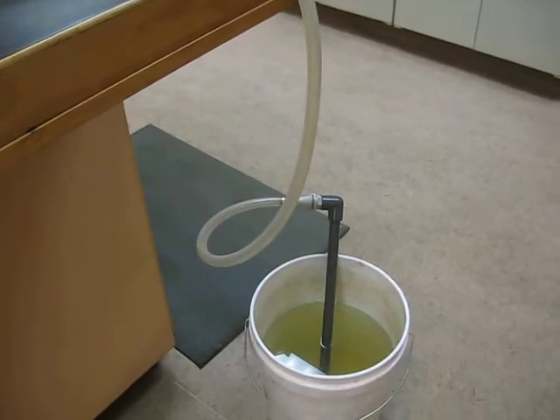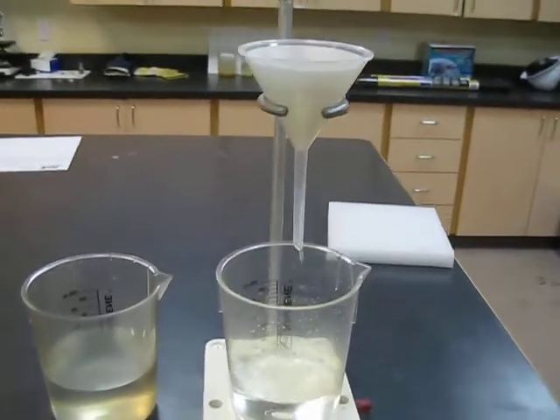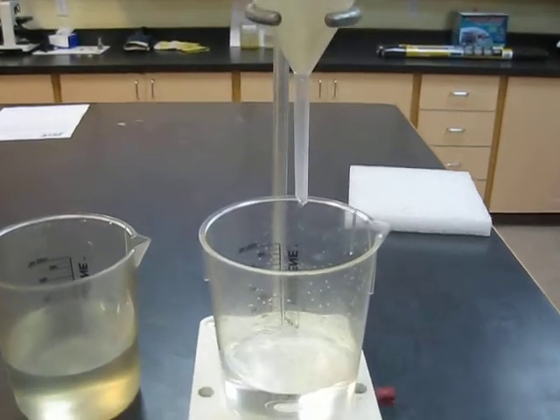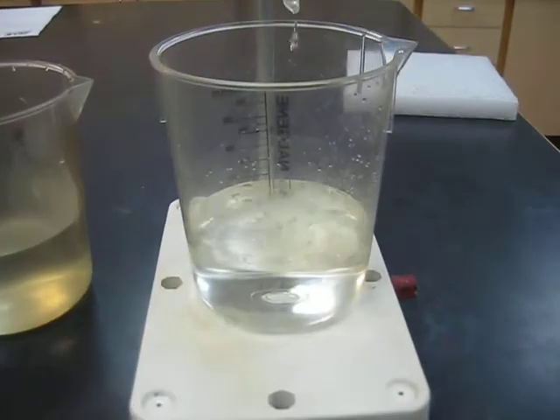And then we're taking that fluid and we're passing it through our filter. And you can see the water through the filter is relatively clean.